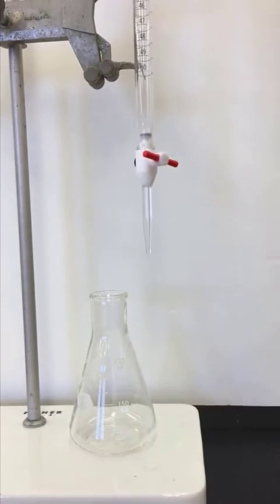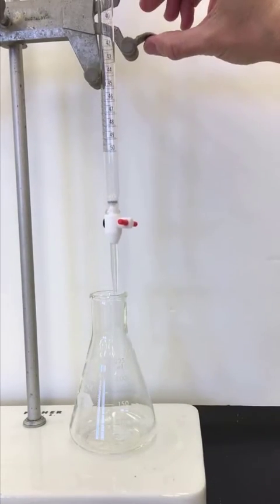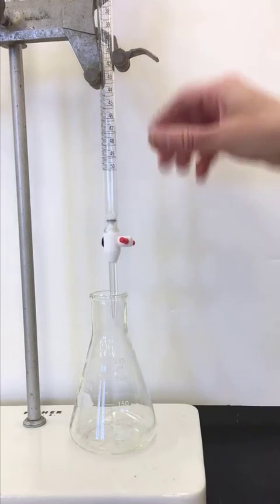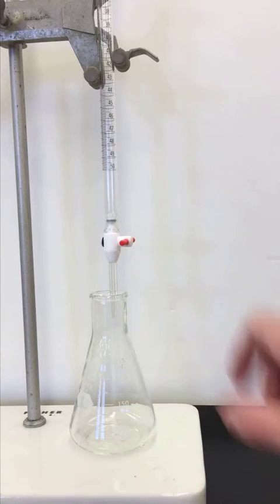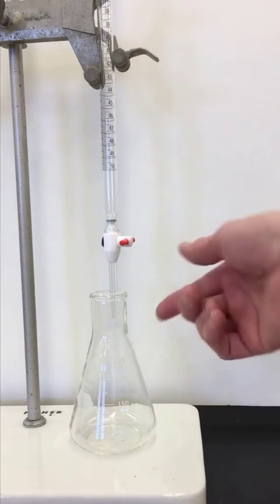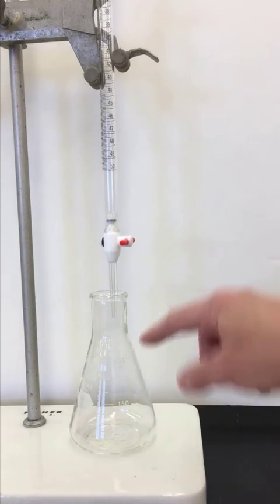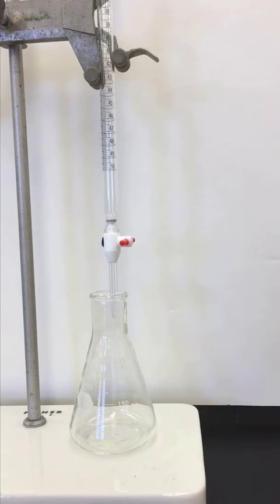We're going to put it in our burette clamp, but this is how our setup would be. We would put the tip of the burette into our Erlenmeyer flask so every drop that comes out of the burette goes directly into the Erlenmeyer flask and we don't lose a drop.